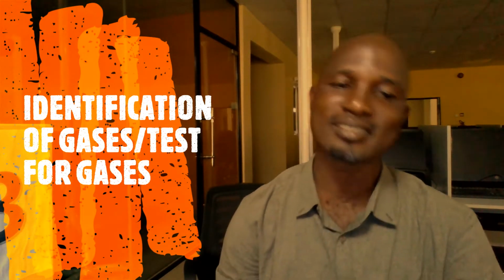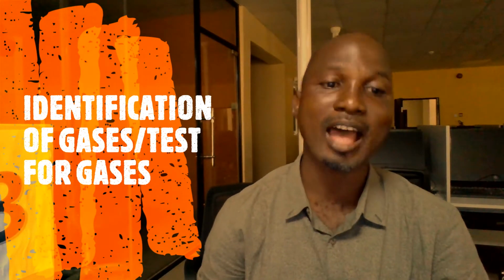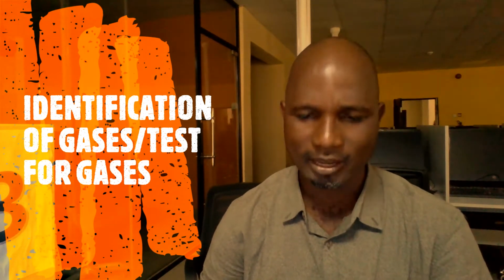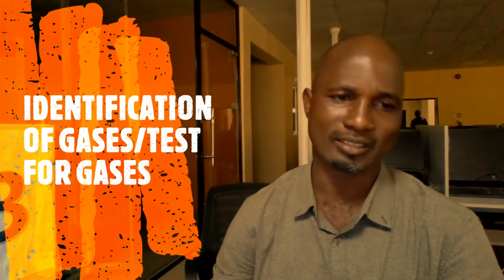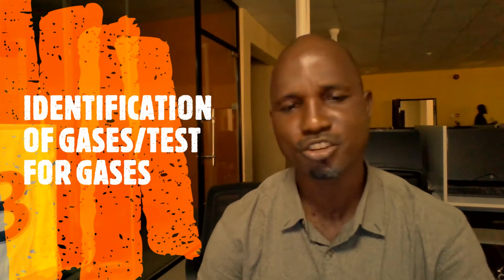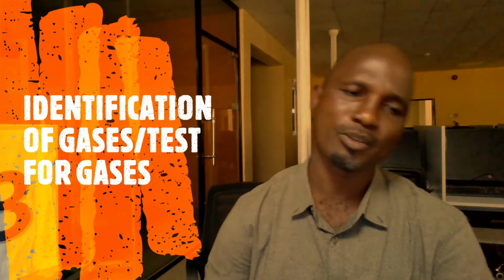There are so many gases out there in the laboratory prepared, and students are always tested on how we can identify these gases, on your knowledge of these gases. And this test is going to be carried out either in the laboratory or in your different workshops. Today I'll be discussing this test for gases, and there are so many gases I'll be talking about today.